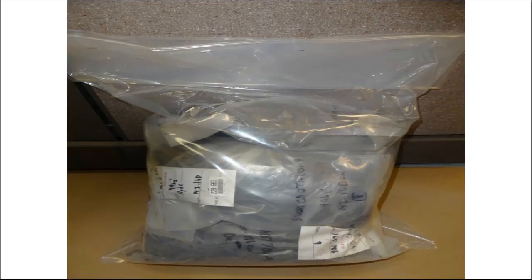So if you're not requesting supplies and you have your own out in the field, make sure that you're contacting us before you ship them in, because you can't ship them yourself. You need to contact us to ship them, and then we'll ask you if you have the compliant shipping materials, and if you don't, we will provide them to you. But this particular secondary container needs to be put into a box that we're going to provide to you.